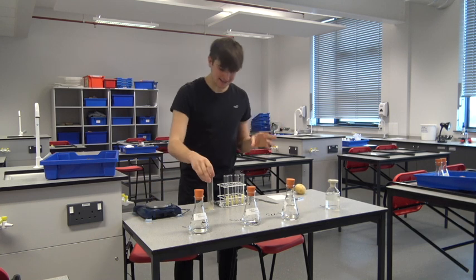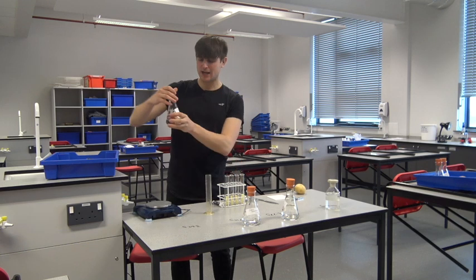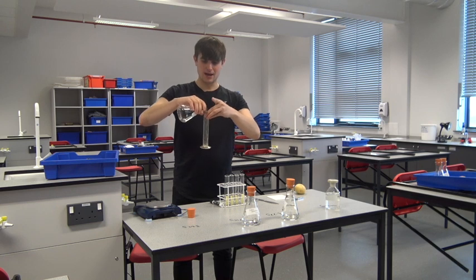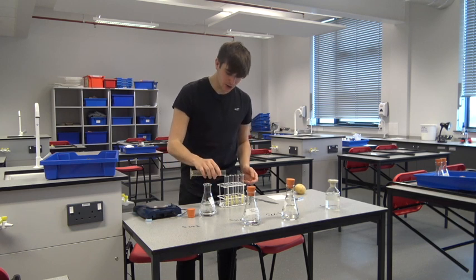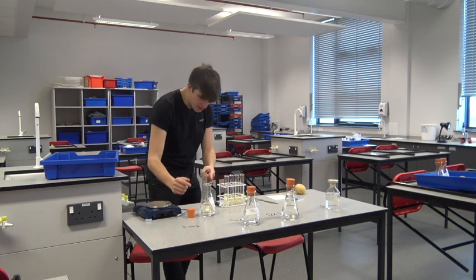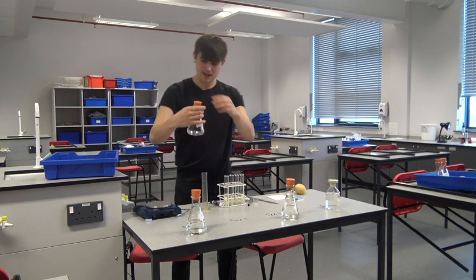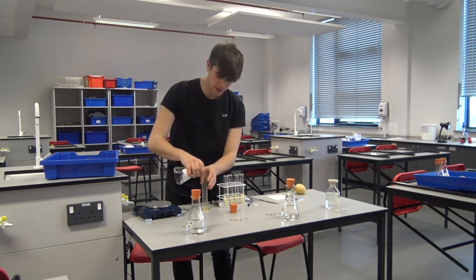I need to make sure that I add the same amount of solution to each of my boiling tubes. The first salt solution is one molar — this is my most concentrated salt solution — and I'm going to add 12 milliliters of each different solution to my potato chip. It's really important that it covers the whole of it, and I can see 12 milliliters is perfect for that.